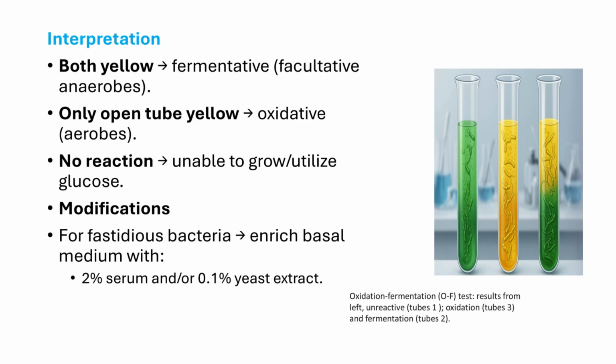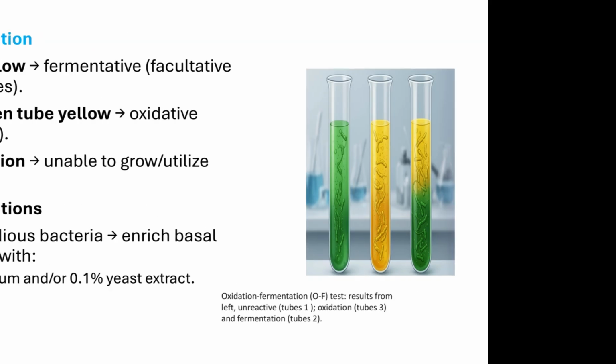For Staphylococci and Micrococci, an alternate OF medium containing tryptone, yeast extract, agar, and bromocresol purple is used. After autoclaving and cooling, 1% glucose and 1% mannitol are added. Bromocresol purple transitions from purple at pH 6.8 to yellow at pH 5.2 to indicate acid production.